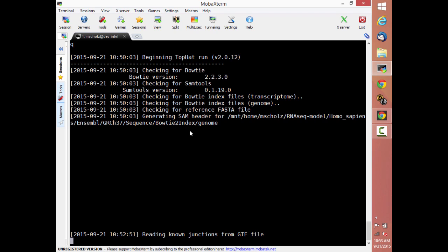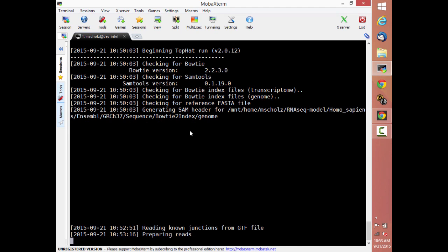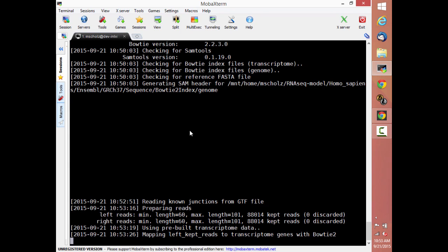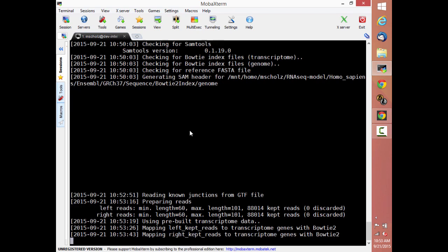So the reads are actually aligning to that. What Top Hat is doing, when it's using the genes and the transcriptome bits, is it's also trying to maintain awareness of the introns and exons that are listed in genes.gtf. Genes.gtf is an annotation file, so it says the gene exists at these locations. If you have a bacterium, the gene starts here and ends here, and all you need to know when you're doing your analysis downstream is what the name of the gene is and what reads align within that region. What Top Hat needs is to be able to do that, and also, by the way, say, all of these places where it splits apart, I need to know what those are. So that model is in the GTF file if it's necessary.